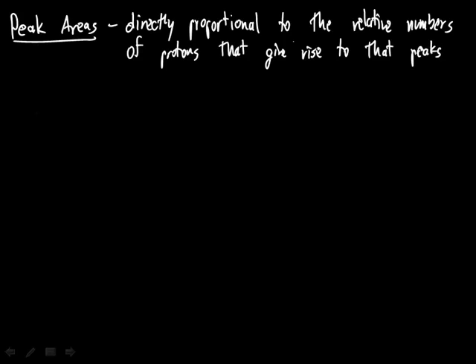I think this is best explained on an example. So if we look at the following compound, which has a methyl group, followed by a carbonyl, then another methylene group, oxygen, and then a T-butyl group. In this compound, we will have three different types of protons.